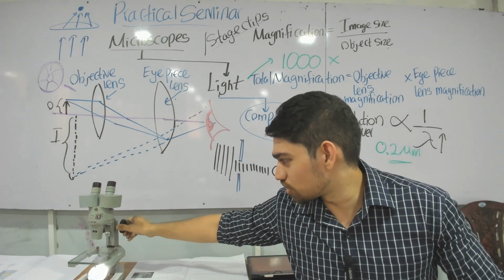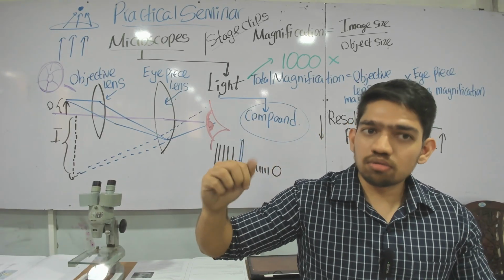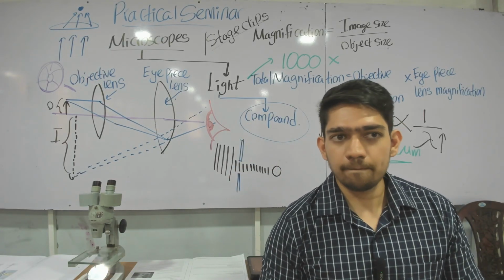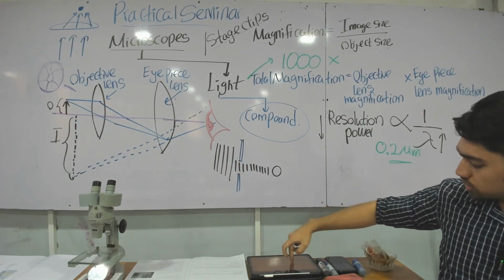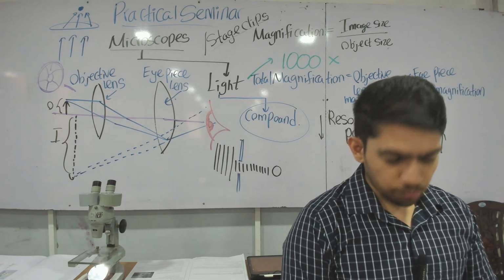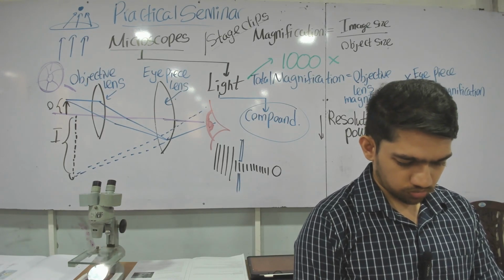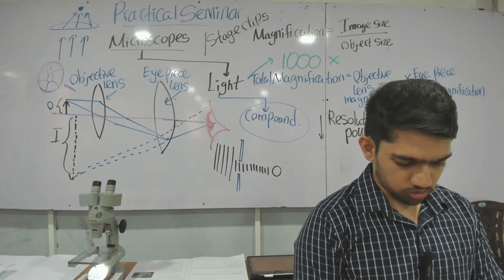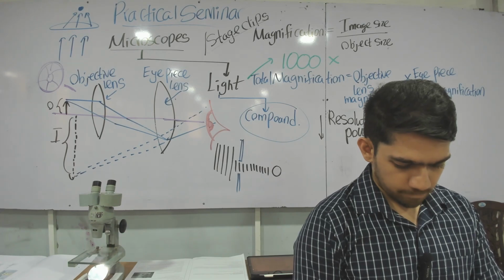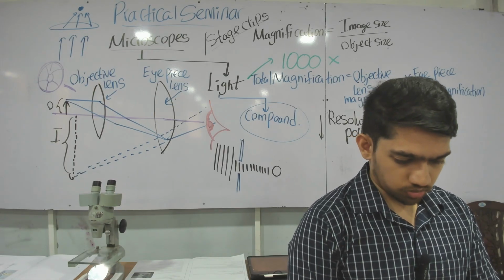So this has only, I think, a coarse one. The fine one you can't even see. The lenses are moving, but it's adjusting them very slowly. Right, write down the function of the fine focusing knob. For precise focusing of the final image.